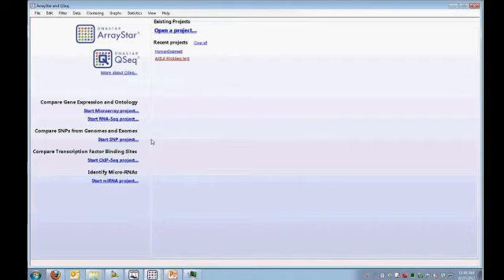Now, I should mention there are some new tools that we're working on. They aren't available right now, but the plan is this September to have some automated tools to recognize structural variants in microbial assemblies and then do de novo assembly across those areas. So in deletions, you might merge. In insertions, you do de novo assembly. Again, right now we can do that manually, but we're going to have some automated tools designed specifically for microbes that will make that work a lot easier. And that's something we can talk about here in the next couple of months in more detail.